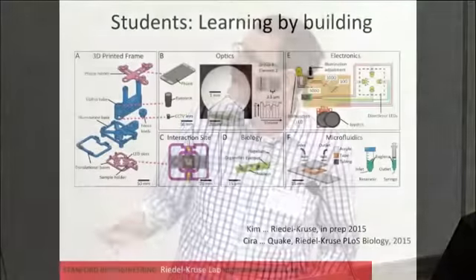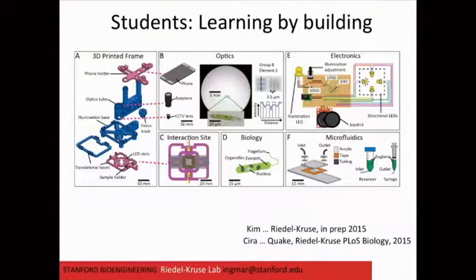We also had some test questions about how big these cells are or how fast they are swimming, which you could see from the game as I showed you before. And what we generally find is that above around 11 years, the kids fully get that. Below, kids enjoy it, but may not fully understand what's going on. And this actually nicely aligns with typical biology curricula in middle school, when most of the biology is taught. Here's basically the whole setup to build something like this.